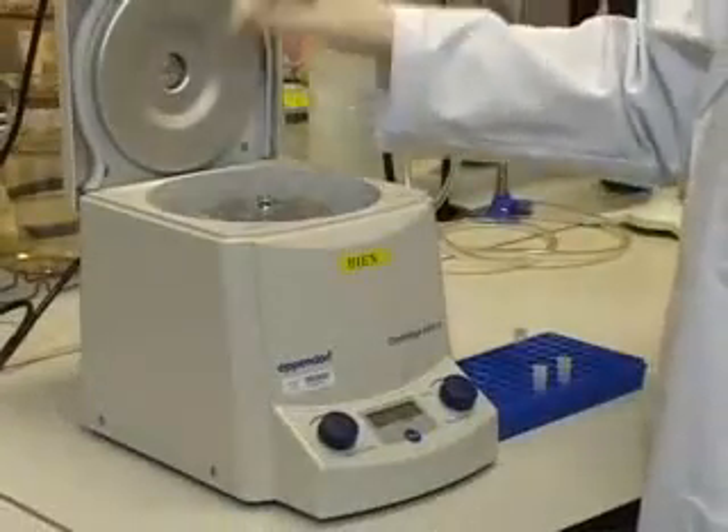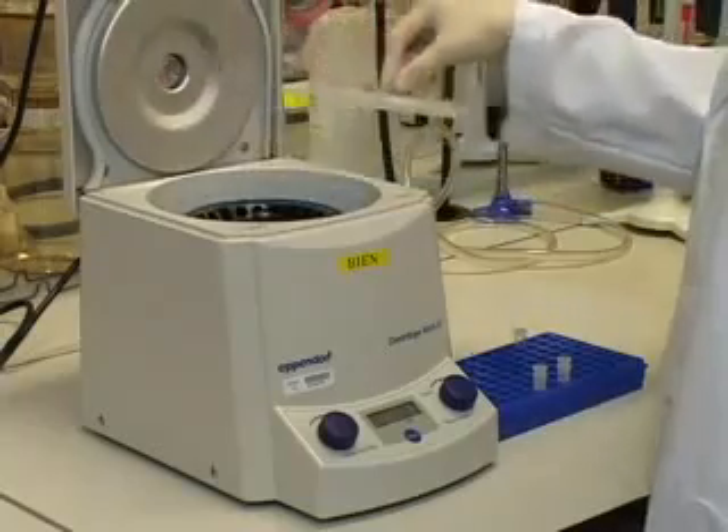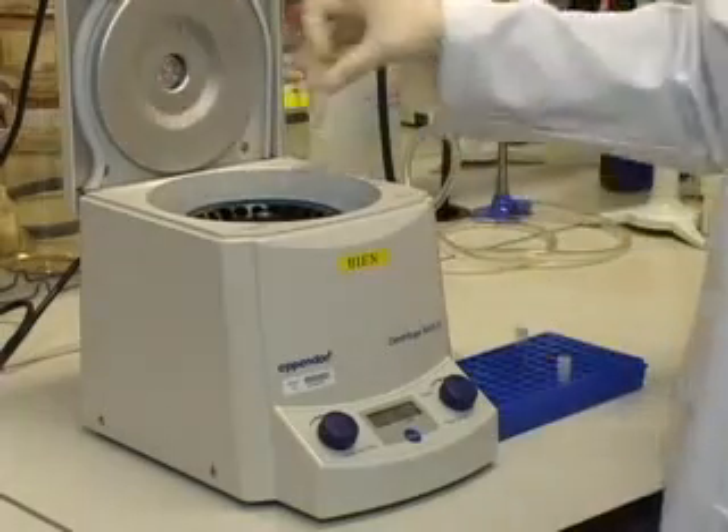Stand for 1 minute, then centrifuge at maximum speed in a microcentrifuge for 1 minute at room temperature.